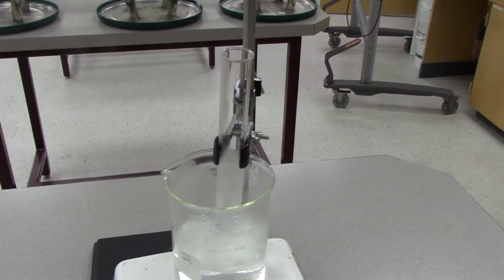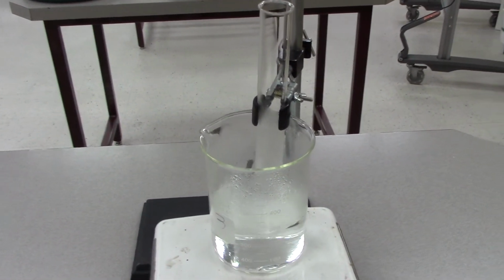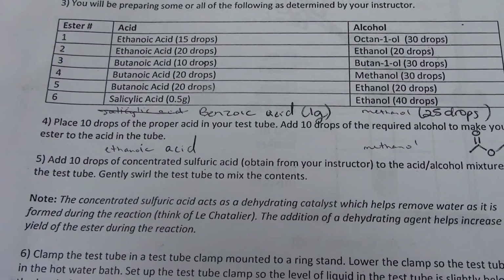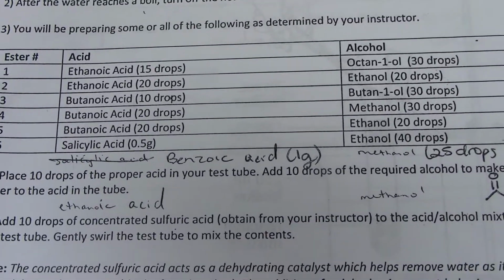What I need to do is measure half a gram. I'm going to make wintergreen, so I need to measure half a gram of salicylic acid. So here is salicylic acid.